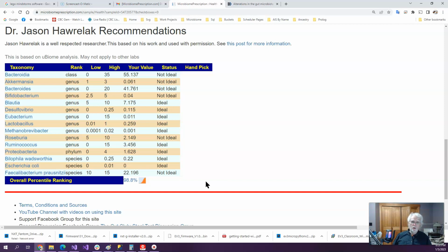Since it's Tasmania, Australia, chances are most of them are meat eaters, so there's going to be a bit of a bias towards a profile for meat eaters. Which means if you're vegan or vegetarian, you may have a poor microbiome simply because you happen to be vegetarian.